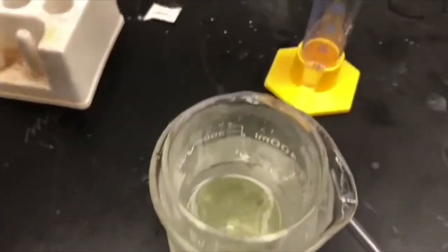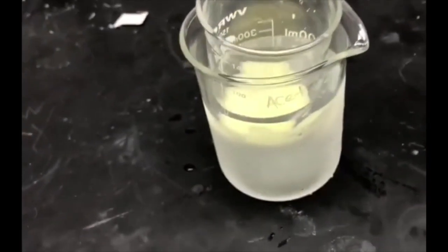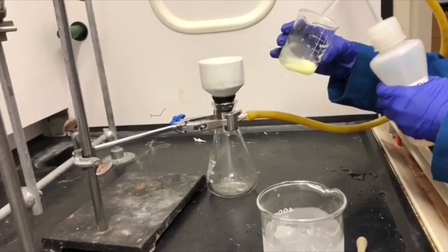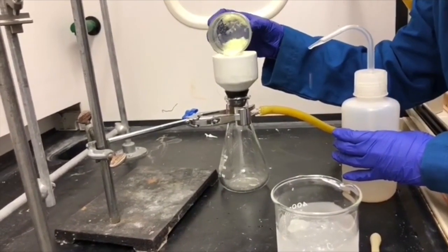Cool it down in an ice bath to reveal our crystallized product at the end. We're doing another suction filtration to harvest our crystals.